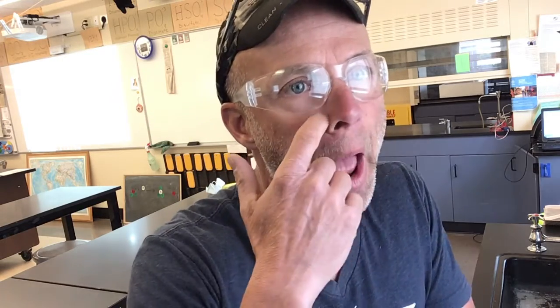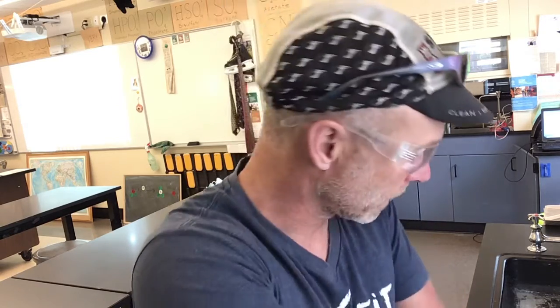Welcome to Lab 1. Today I'm going to show you a video, but the next time you will be doing this work in the lab with more specificity, with more trials. The idea here is to determine the role of each chemical in a chemical reaction inside a bag. So we're going to look at this lab.